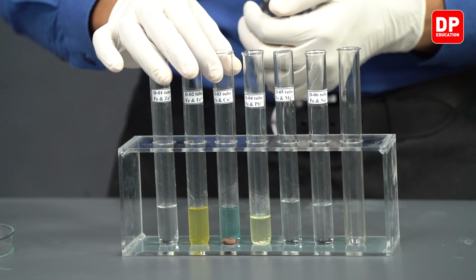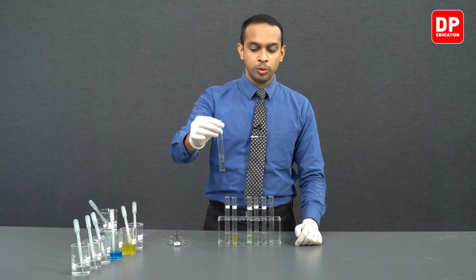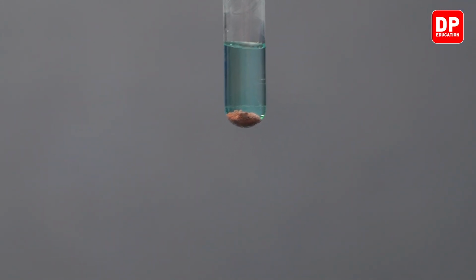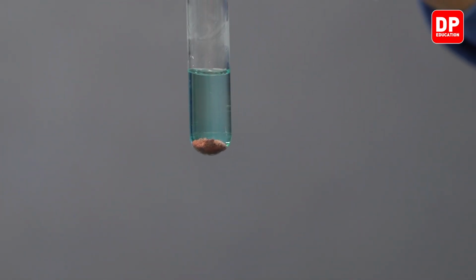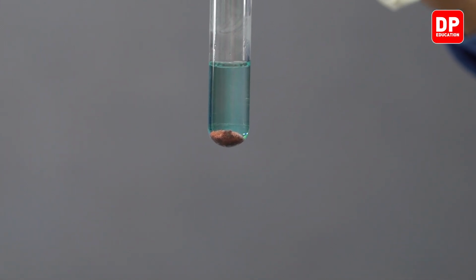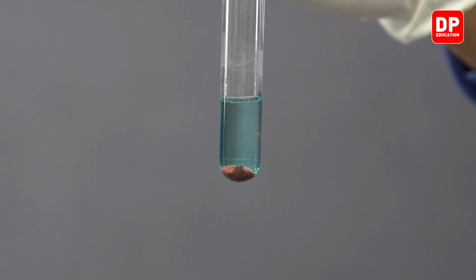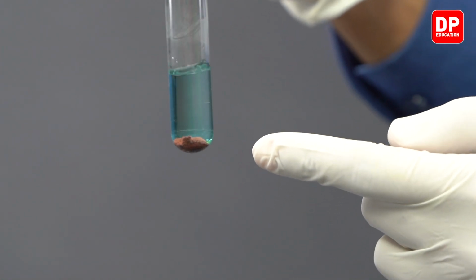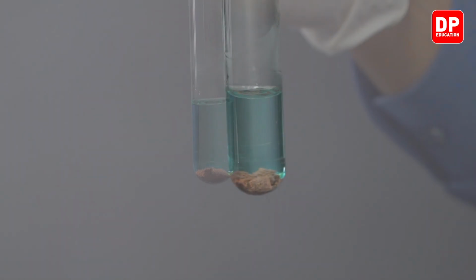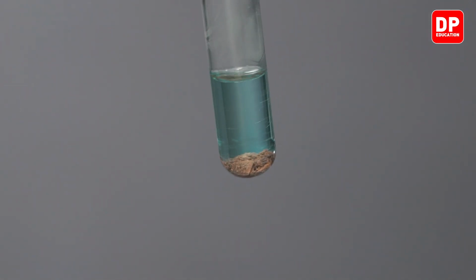Then we move on to copper. Over here, we have the copper 2 plus aqueous ion solution. At the bottom, you can see a brownish precipitate. So this indicates that copper 2 plus aqueous ions have reacted with the solid iron that we added into this medium. So this is a very interesting precipitate. You can very clearly see the precipitate, and the color of the copper sulfate in the medium has gone down. Let's take a closer look at the precipitate.